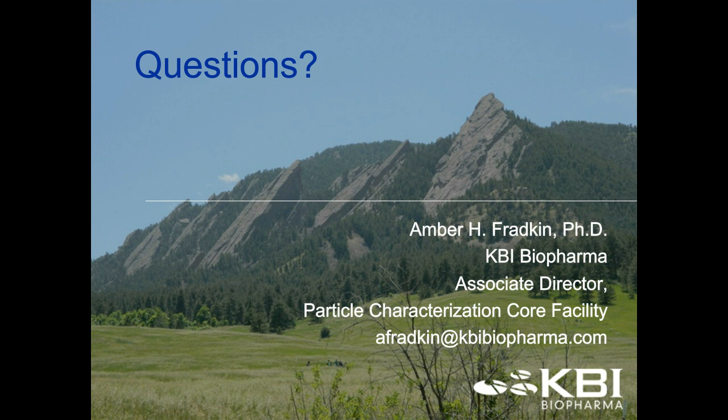Great, thank you, Amber. Got another question here. Someone says, we typically only identify visible particles, and is there a push to identify subvisible particles too?